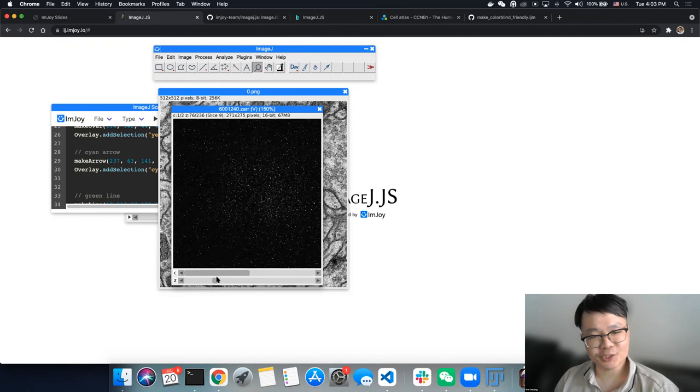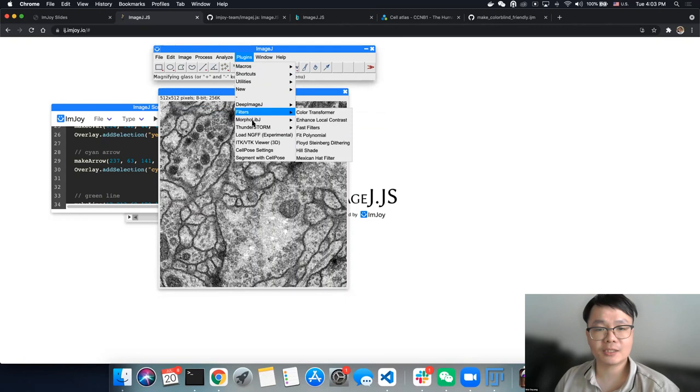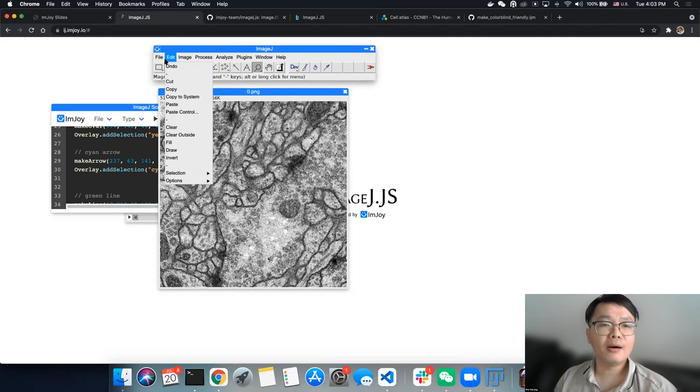The idea is that when you have a huge, massive file, you can pull the corresponding chunks here, although there are other limitations. For example, ImageJ doesn't support chunks on the XY plane. This is one of the limitations, but we discussed with WEM and there's some way to improve it in the future.